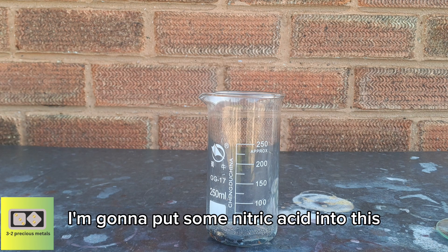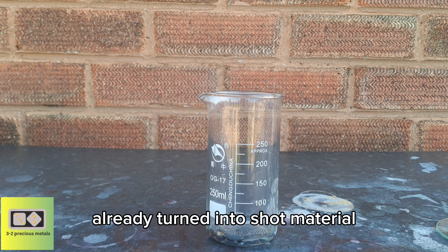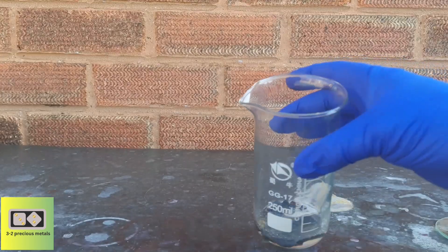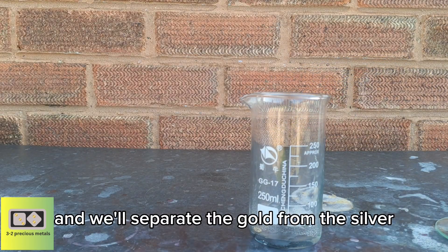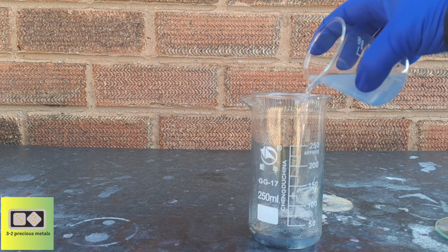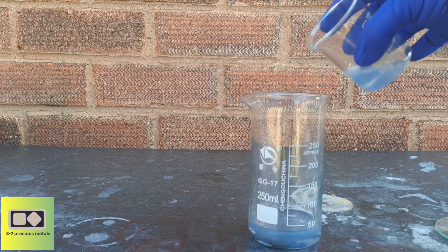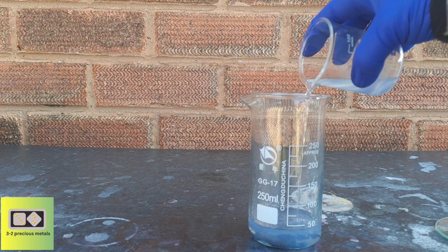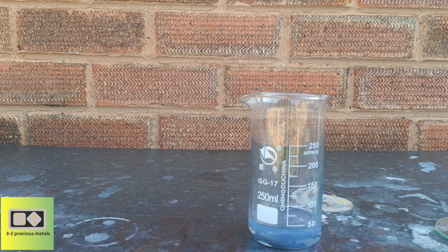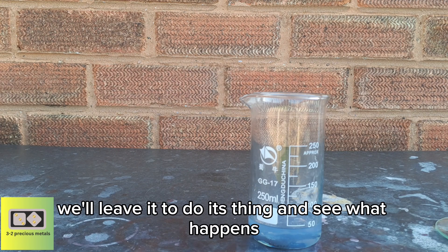I'm going to put some nitric acid into this material, which has already been turned into shot material, as you can see. And we'll separate the gold from the silver. I'll put about 20ml of nitric acid in there and we'll leave it to do its thing and see what happens.